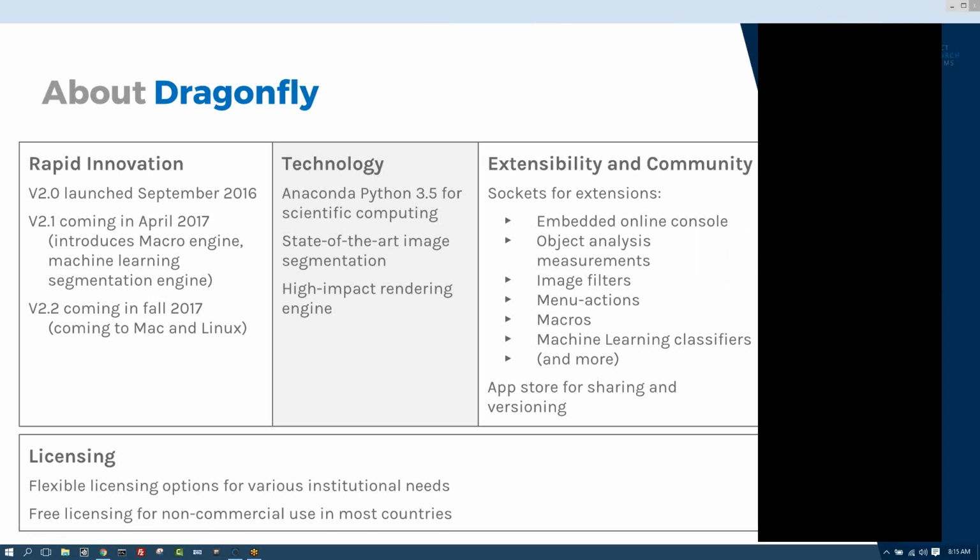I will mention that the last time I was exploring Mac for applications like this, and I was using Parallels, Parallels and some of the other virtual machines restricted how much of the graphics memory the guest operating system was able to use. So if you're only able to access 500 megs of your 4 gigs of video memory, then you were really hamstringing what you could accomplish. Because of that, if you were going to work on the Mac hardware, you would be better off rebooting in Boot Camp. But I know that's a headache, and you're no longer taking advantage of your Mac operating system. So we don't have a really good answer for that.